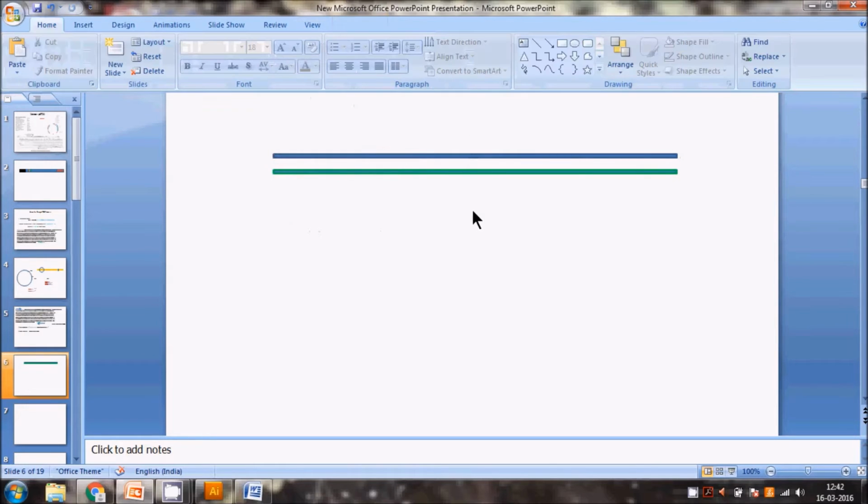Okay, so for example these are the two-stranded DNA, and this one is 5' from the top, and this is 5' from here. So we know that this is 5' to 3' and this is 5' to 3', so these are anti-parallel, right?